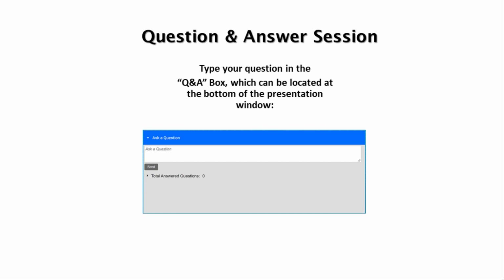Excellent. And just following up here, the USP method we are using now uses older columns with larger particle sizes and large volumes like 4.6 by 250 millimeter. We want to speed up our methods, use less solvents, and also move to columns which are not close to being discontinued. Where do you recommend we start with modernization? I know that was a mouthful.